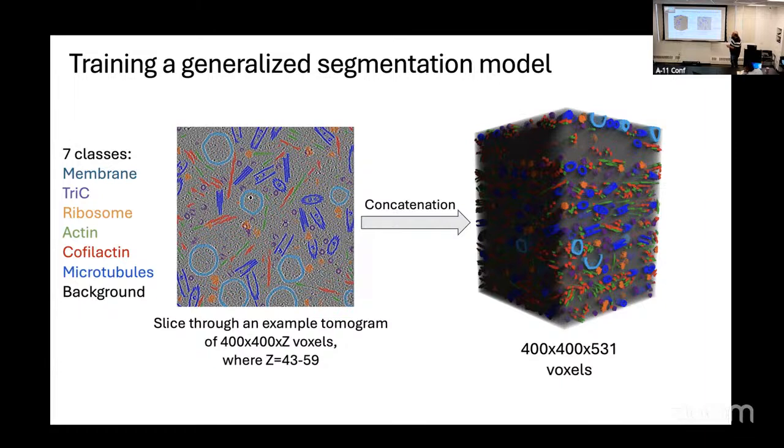We simulated these tomograms of 10 different models with random defocus values. Within a certain range, they're not wild, but within a reasonable range, we randomized all of the optical parameters so that these 10 tomograms have a large variation in their content and their simulation parameters. And then we concatenated them just to feed them into Dragonfly as one block of data. It's simpler that way.